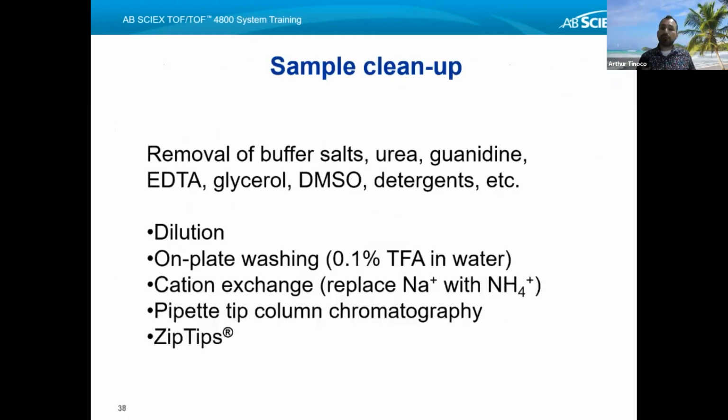All right. But there are going to be occasions when you have a sample that you want to see in MALDI and it's pretty dirty. That's not necessarily the end. You can certainly clean up your sample, and there are different ways in which you can do it. A classical way, if you have a pretty high concentration sample, is the method of dilution. That works well. That's why I suggest you make a sample in DMF or DMSO, then we're going to dilute it extensively so that we have, let's say, no more than 2% of these solvents in our background.